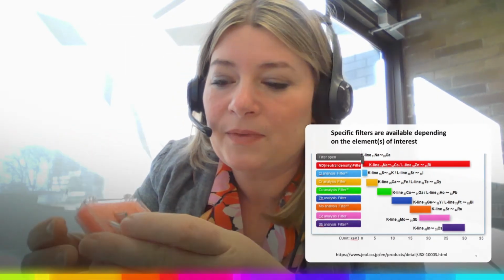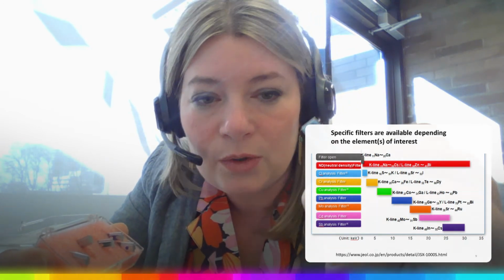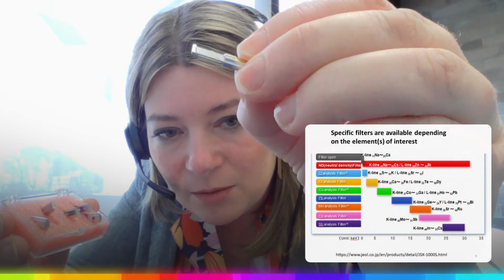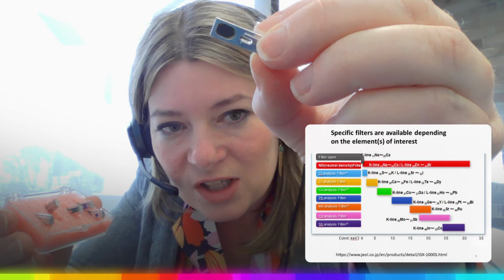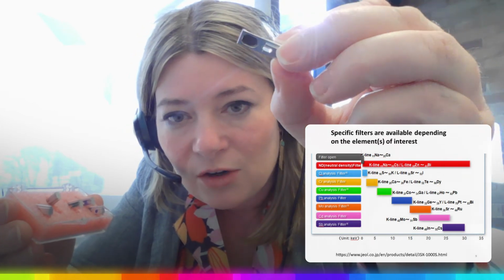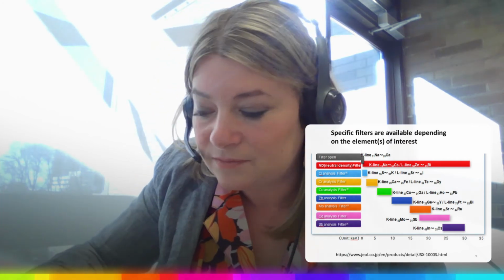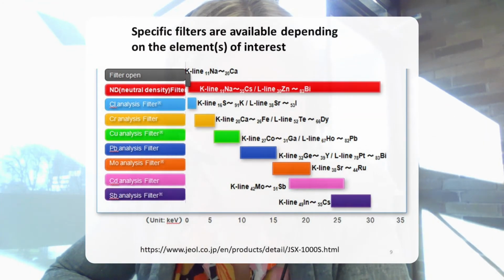They're pretty simple. They're just metal sheets glued onto an aluminum holder. There's the back side where you can see the metal sheet and the window showing the metal sheet itself. And you can make your own filters to suit your own specific application. And these are some commercially available filters for different elements with different sensitivity.